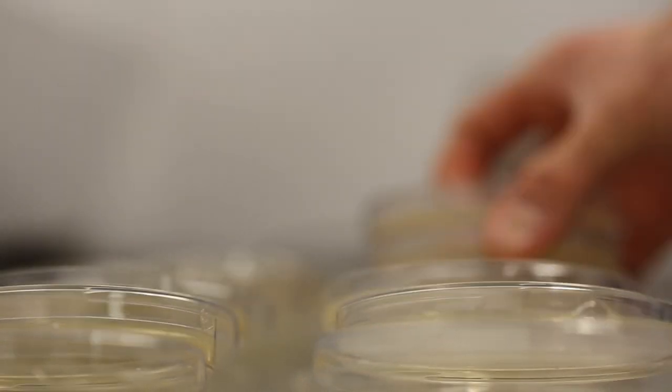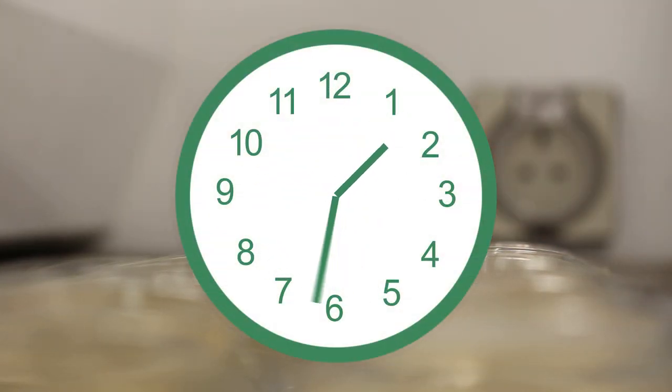To prevent this from happening, users should monitor how long agar plates are dried for, taking into account the intensity of their drying procedure.